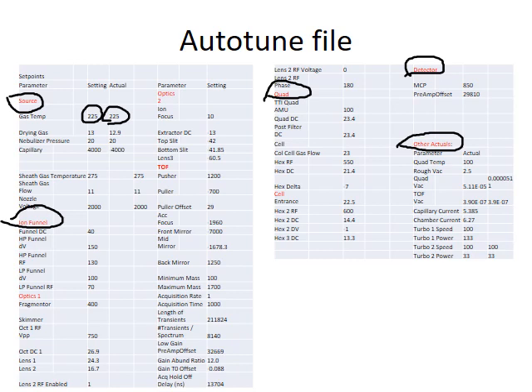This is a rough vacuum. And your quadrupole vacuum and your TOF vacuum. Vacuums give a very good indication of the status of an instrument.